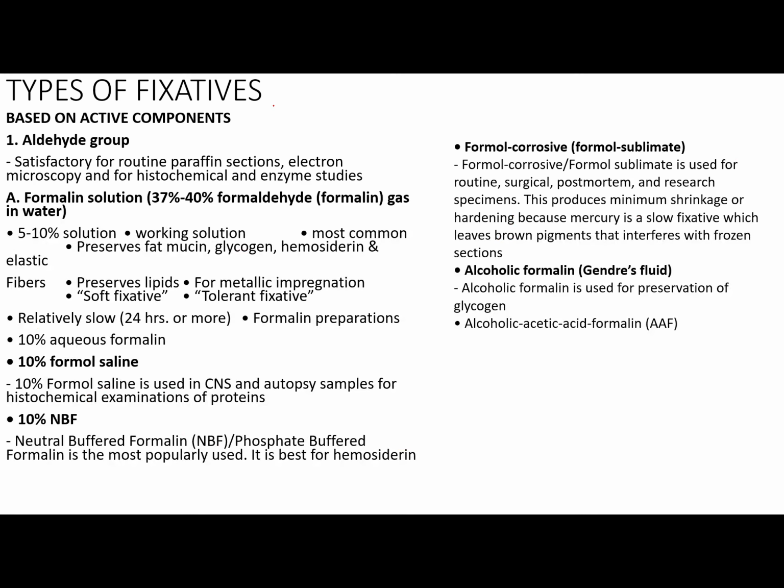Now based on active group class, we have the first one. We have the aldehyde group. Now aldehyde group class is satisfactory for routine paraffin section, electron microscopy, and for histochemical and enzyme studies. So ito yung mga formaldehyde, aldehyde. So under this group, let's start with the first one, yung formalin solution. Formalin solution could be at a percentage of 37 to 40% formaldehyde gas in water.